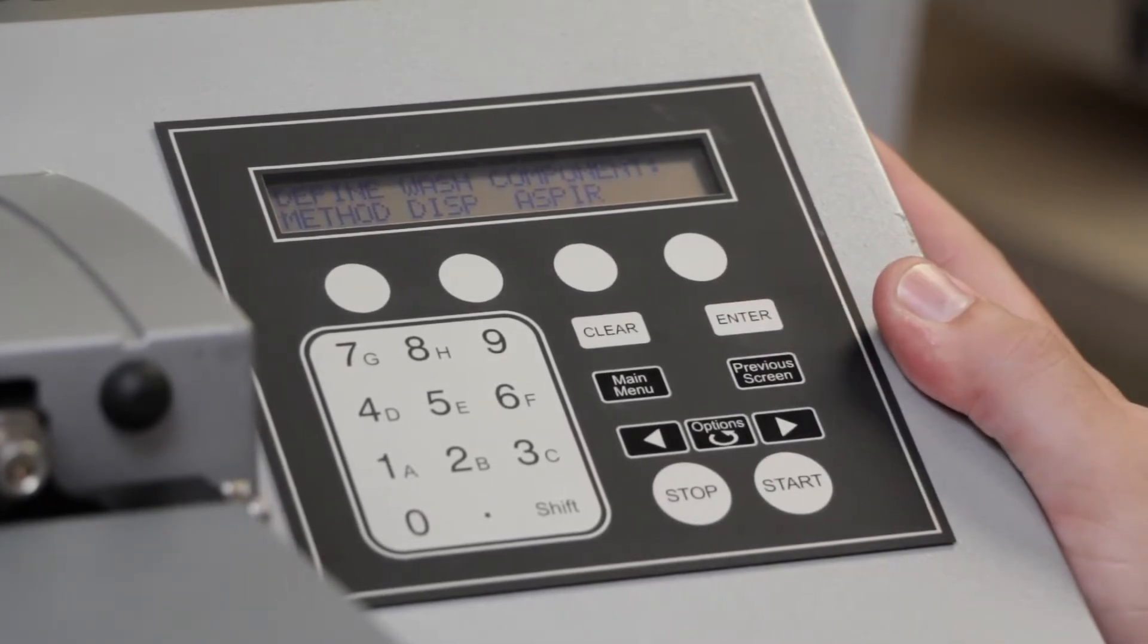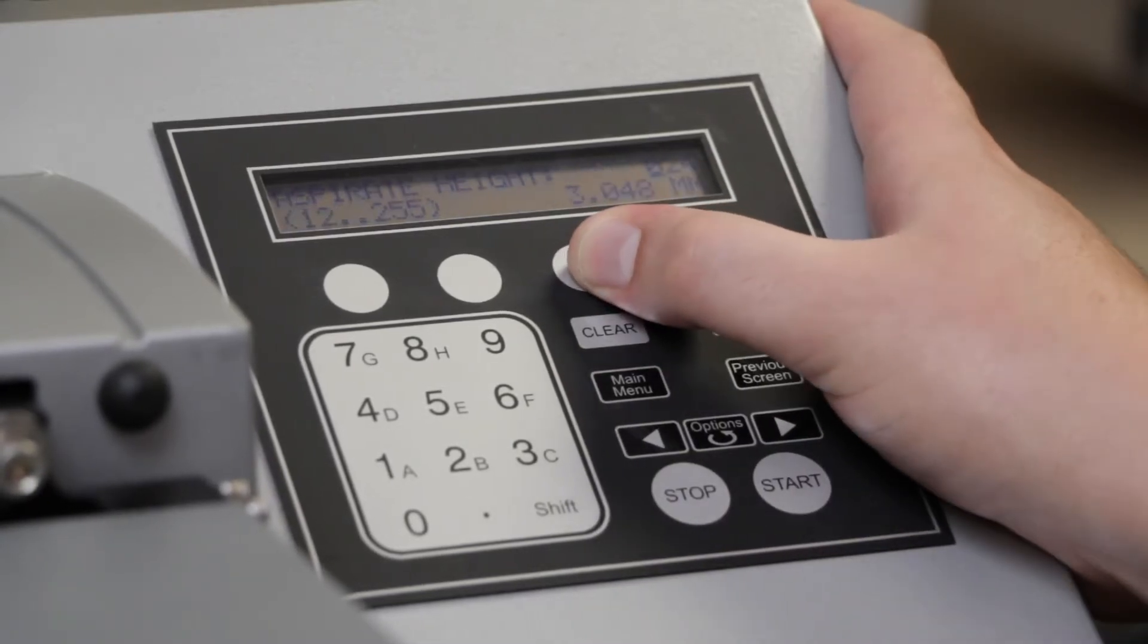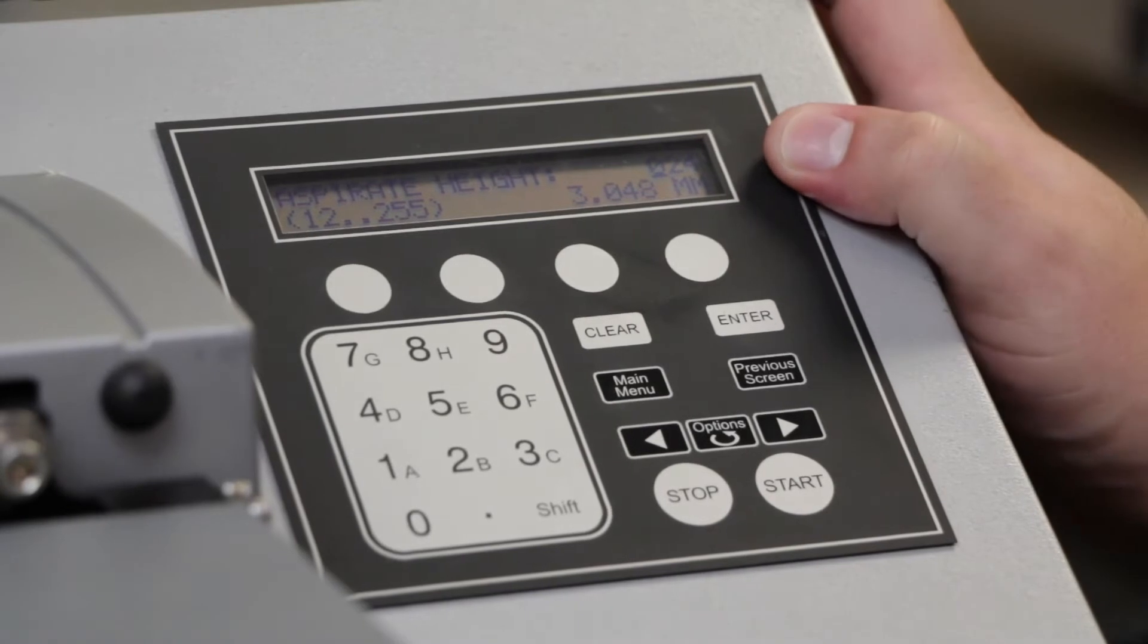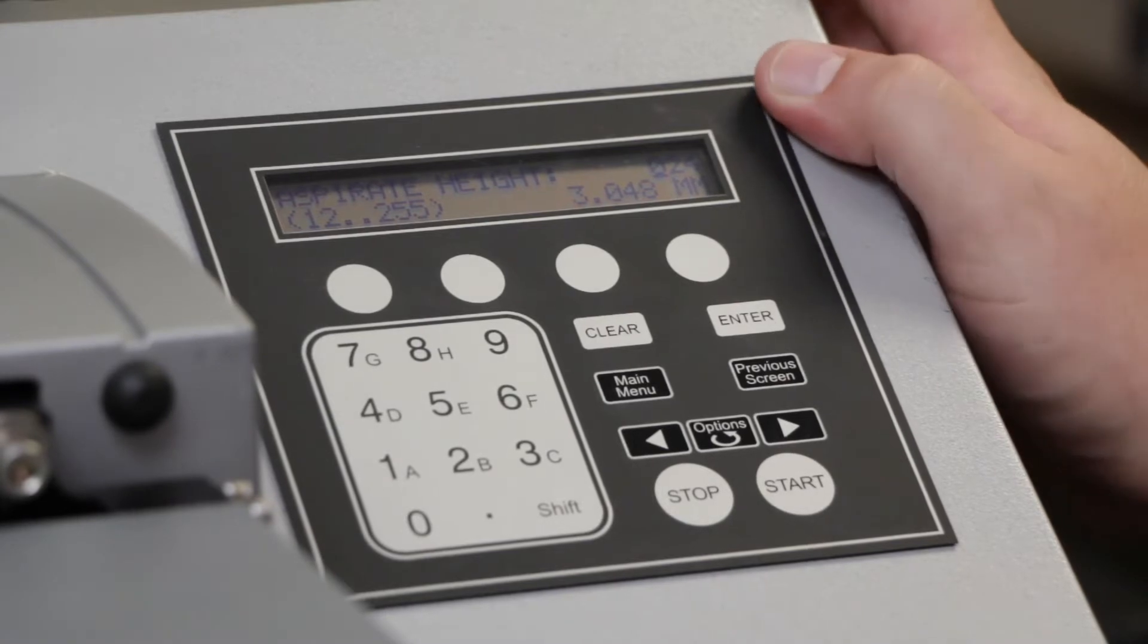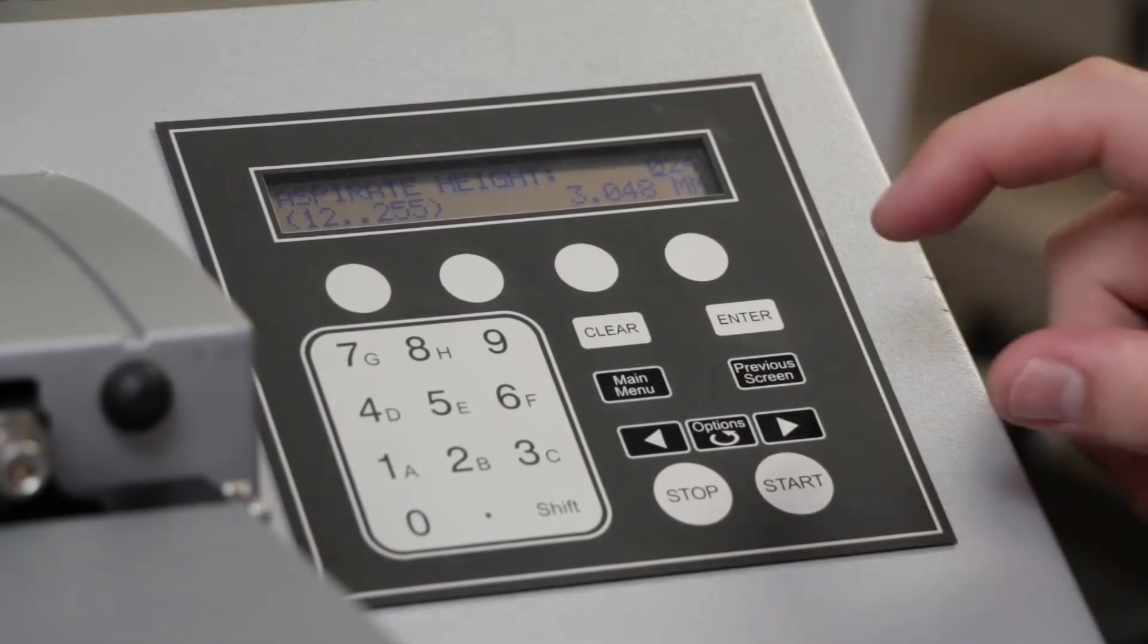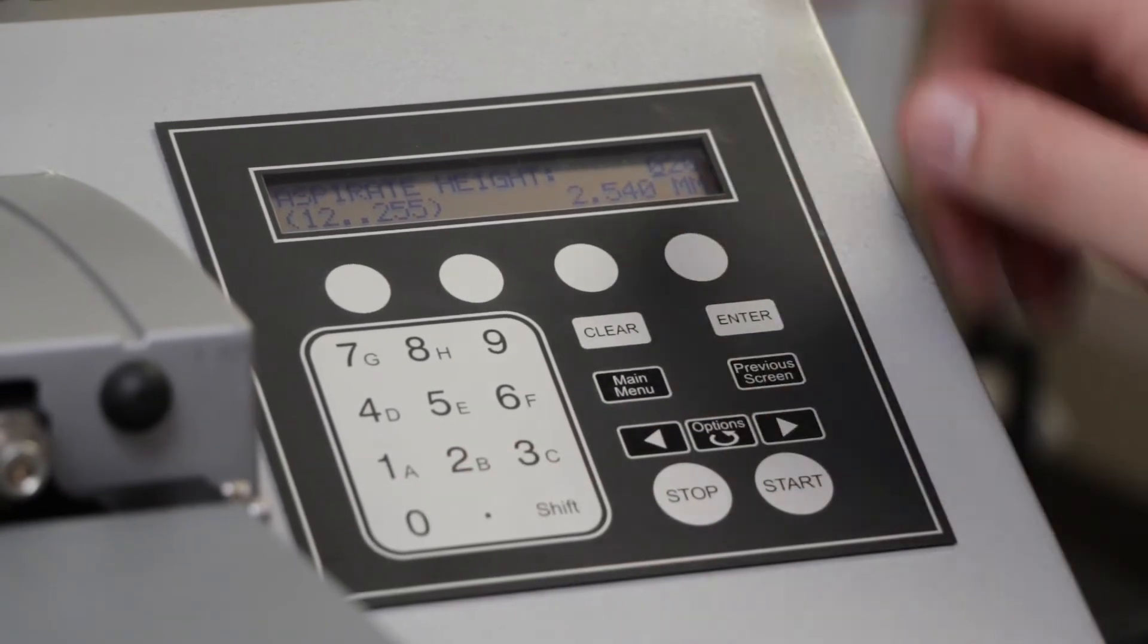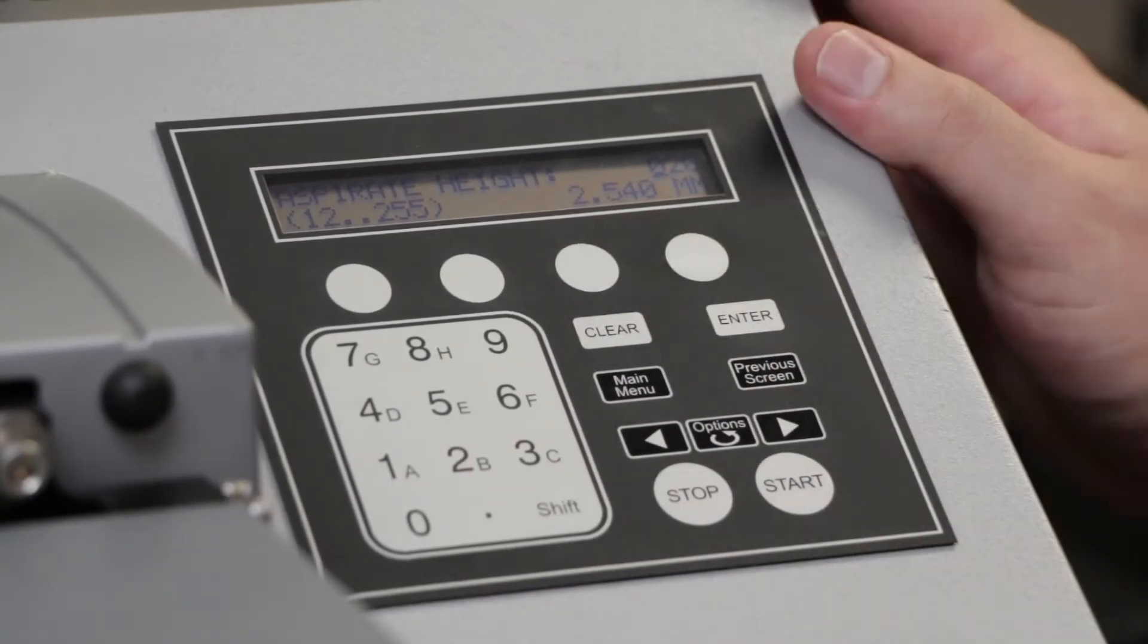Next, we can fully define our aspirate steps. Pressing the aspirate button, we're prompted with our aspirate height. This is where you'll decide how much volume you want to leave in your plates. Again, you'll need technical drawings or to use the adjust utility to truly fine-tune this. But in our case, we're actually going to lower our aspirate height down to the 20 step set point or 2.54 millimeters.